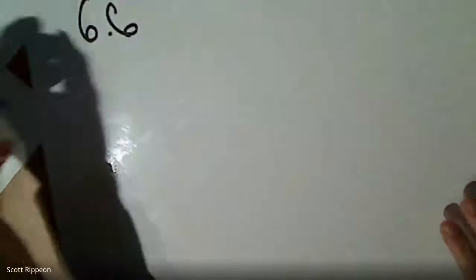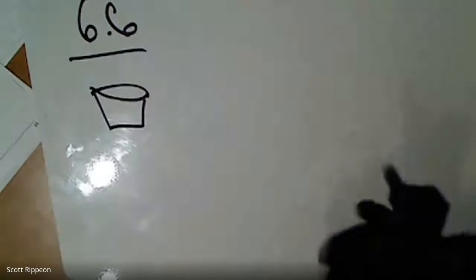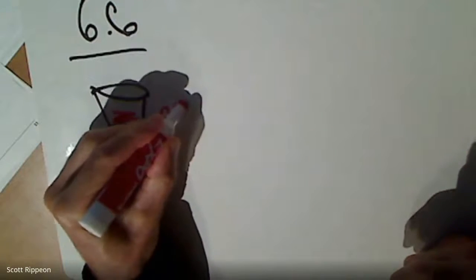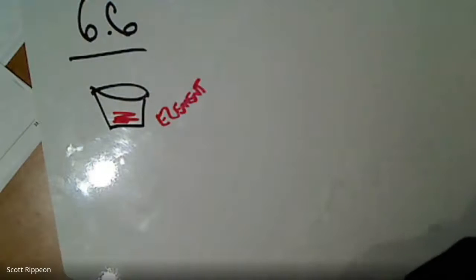Okay, lab 6.6 through 7.1. So let's start with 6.6. I know we did a little bit of this before, but I want to really go into it in detail. All right. 6.6, we started with a crucible. And into that crucible, we put some plain copper. All right, the element copper. And that is a pure substance because it's only made of one thing.